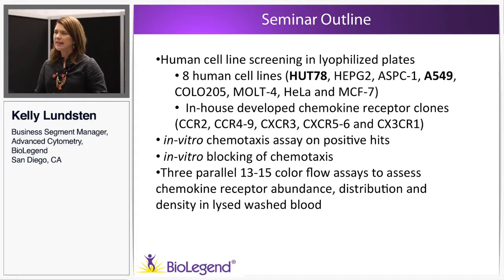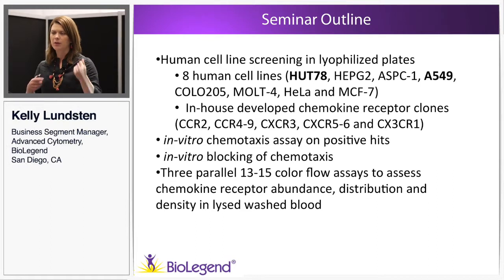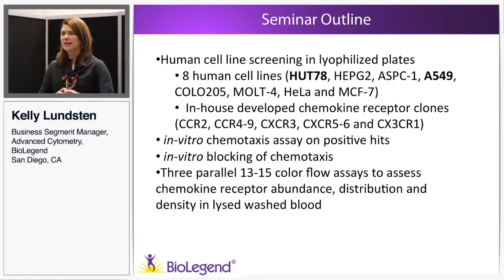But the HUT78s, a human T-cell lymphoma cell line, was by far the best model that I could use. And so most of the data that I'm going to show you today is on the HUT78s.